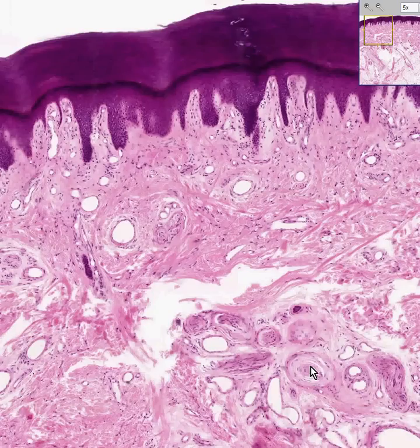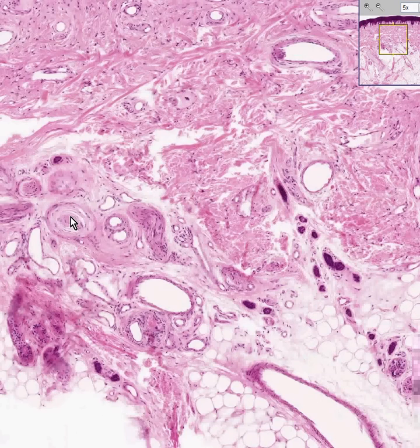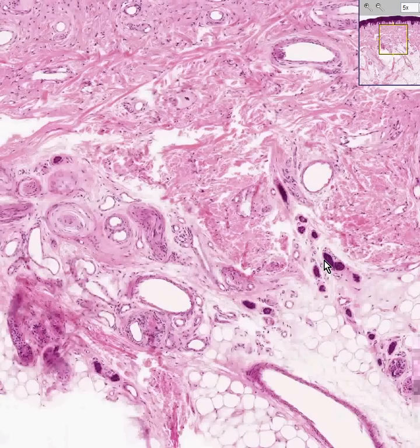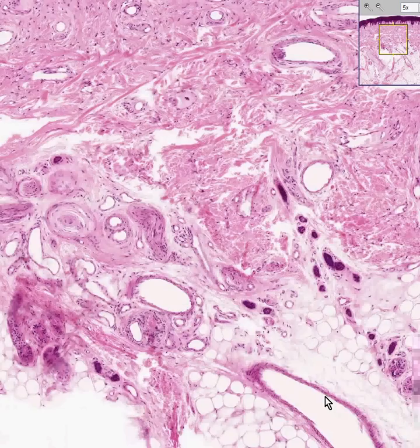Moving around a bit more, you can see that there are the ducts of eccrine sweat glands here, and here, and here. Remember, thick skin is extremely rich in eccrine sweat glands. Here are the actual acini of eccrine sweat glands.